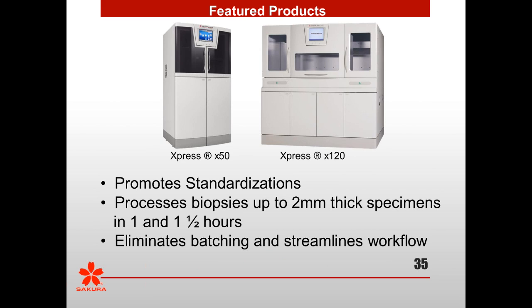I have found consistently that pathologists are very interested in high quality, consistent, day-to-day results, and the tools are just a mechanism to help you gain that. I don't have any magical suggestion, but it does require that you demand compliance from whoever is in charge of managing those individuals, just as you would if you have supervisory authority over your histotech. If you wouldn't allow them to use a nicked or dull blade to cut tissue sections, you demand that they use the appropriate tool. So that's how you have to move forward with that.